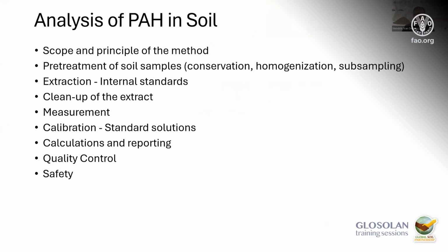We will also deal with the pre-treatment of soil samples. That is everything that comes before we have a subsample for analysis: conservation of samples, homogenization of samples, and subsampling. Then we will cover the extraction and the addition of internal standards, the cleanup of the extract, and the measurement with GCMS.